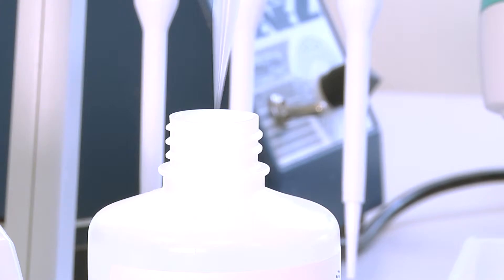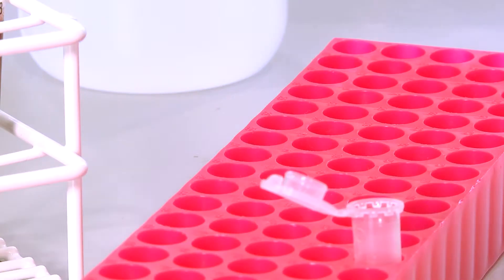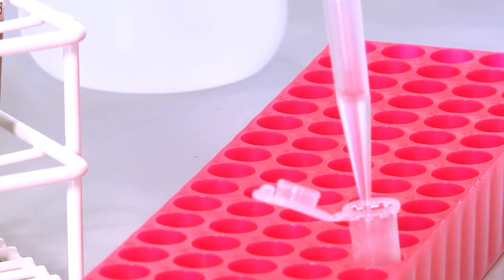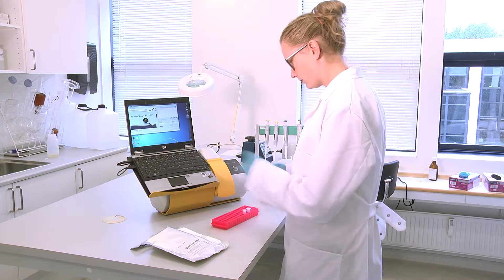With the use of our innovative lysis buffer, we can, if needed, separate clumps of cells and remove adipose-derived micelles from the sample.